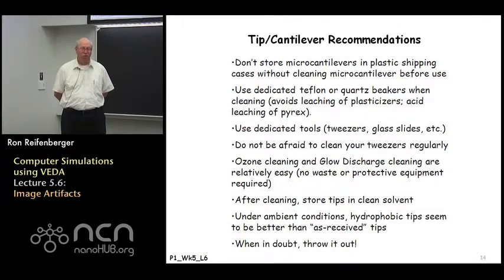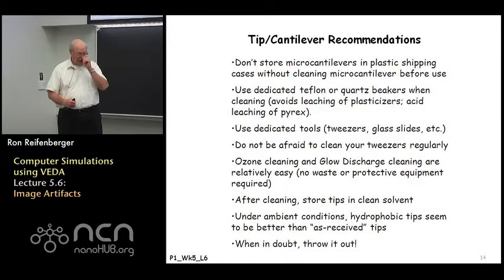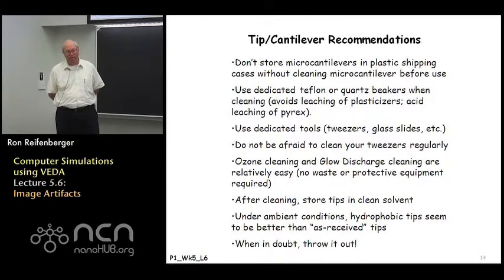We make use of ozone cleaning and glow discharge a lot. It seems to help tips and clean off cantilevers, especially if they've been laying around for a long time. And some of my students have found it very useful, after cleaning a cantilever, to store that cantilever in a clean solvent until it's actually used. So they'll actually drop the cantilever chip into a small test tube that's filled up with a solvent of their particular liking, and it seems to maintain the cleanliness of the cantilever oftentimes better than if the cantilever is just stored under ambient conditions.